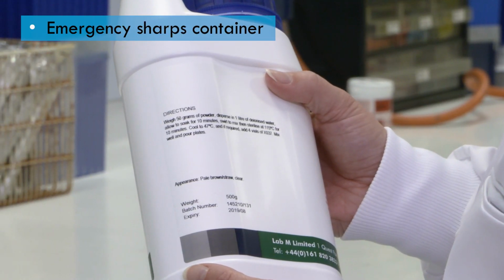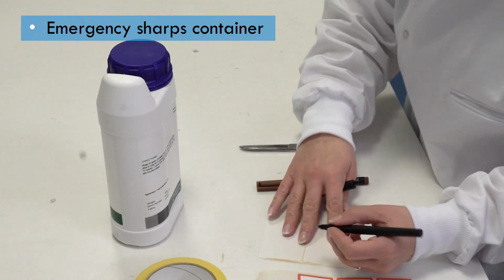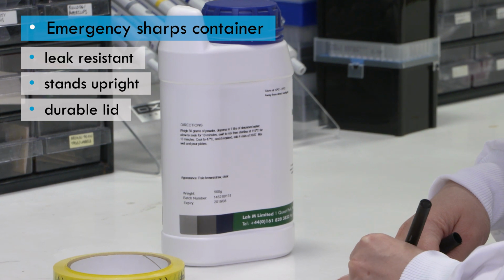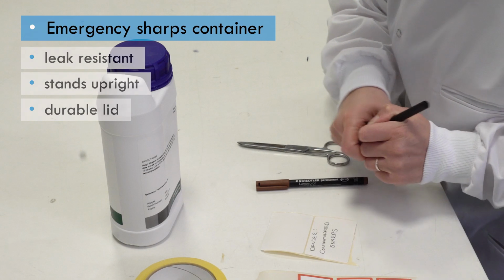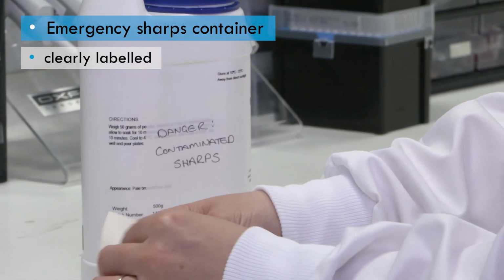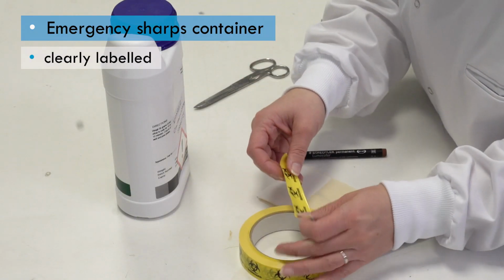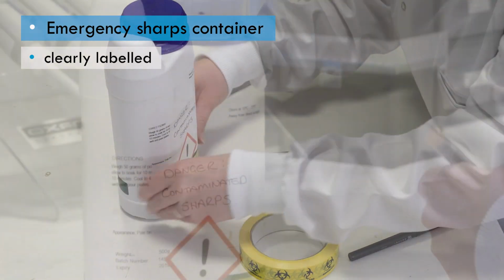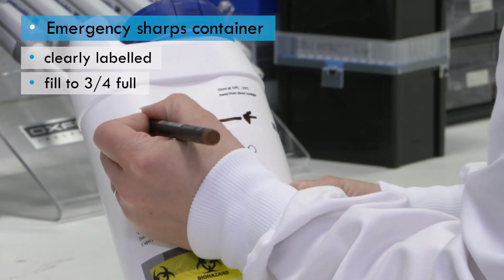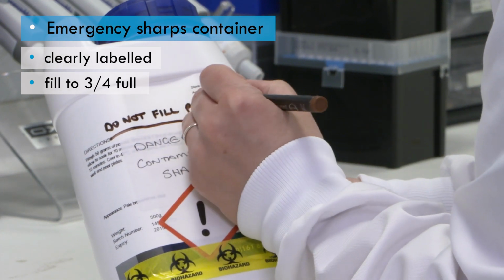In emergency scenarios where sharps bins are not available, a heavy-duty plastic household container, such as a laundry detergent container, could be used as an alternative. The container should be leak-resistant, remain upright during use, and have a tight-fitting, puncture-resistant lid which can prevent sharps from escaping. It needs to be clearly labelled to highlight the hazardous nature of the waste it contains. As there will be no maximum fill marking on the container, only fill to approximately 3/4 full before disposal. The method of disposal should be the same as that for specially designed sharps bins.